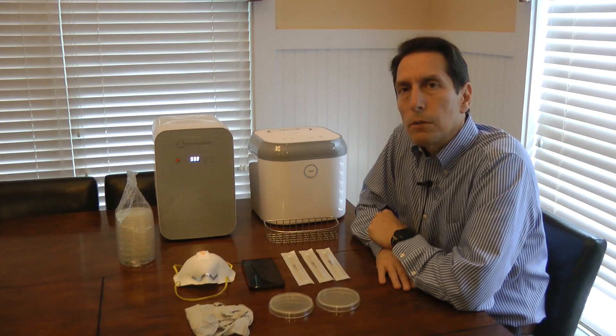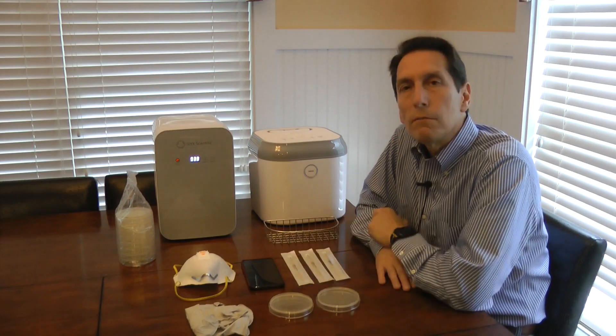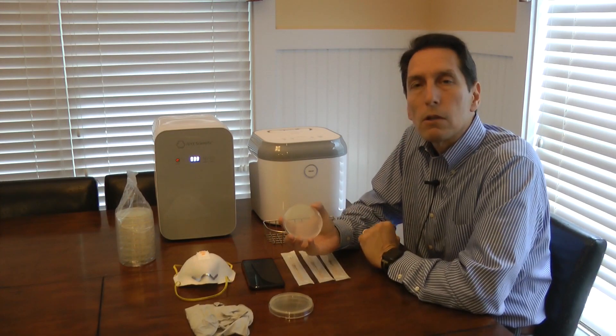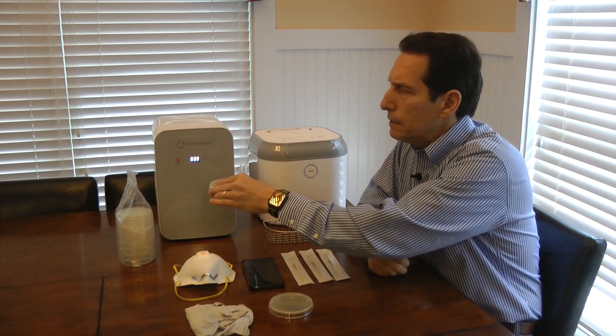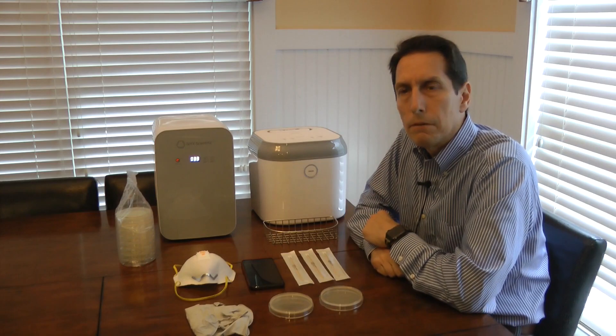So today I thought I'd do a simple experiment. What I'm going to do is take a swab and swab the surface of my phone as well as the interior of a mask that I've worn. I'm going to use those swabs and scrub them across the surface of an agar plate inside this petri dish, which allows the bacteria to grow more efficiently. Then I'm going to place the plate inside the incubator and let the bacteria grow at a controlled temperature for a period of time.